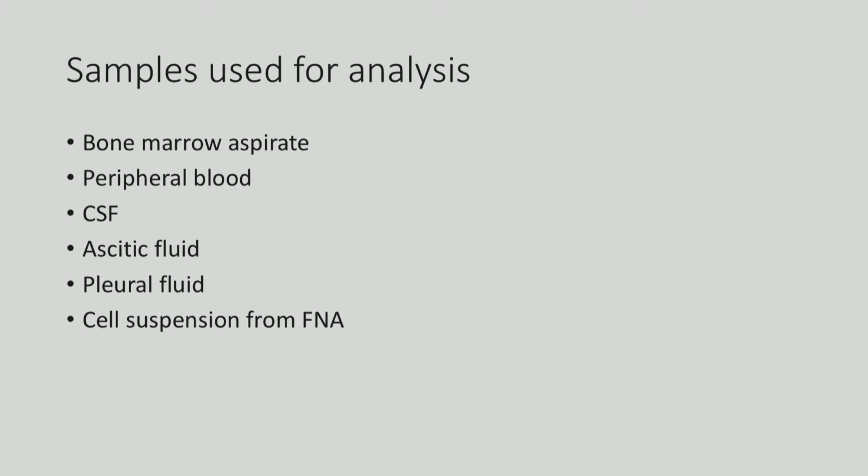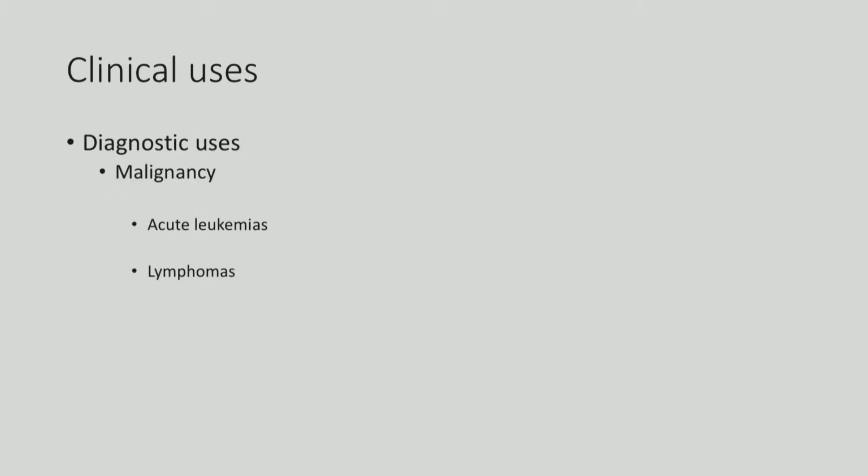But if the tumor mass is not accessible and fluid is accessible, like a mediastinal mass along with a big pleural effusion, then we can tap the effusion instead of biopsying and send it for flow cytometry. That is the easiest way. And then blood. If we have a possibility of diagnosis on the blood, we can use the blood for running a flow cytometric test.